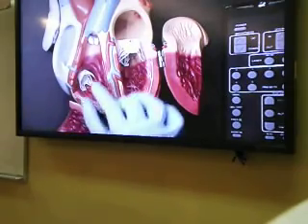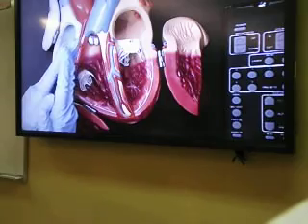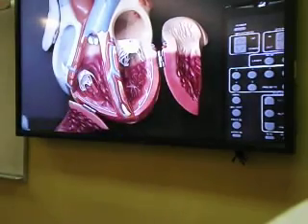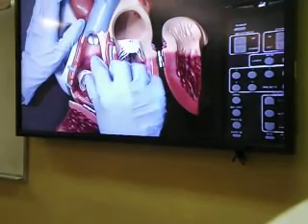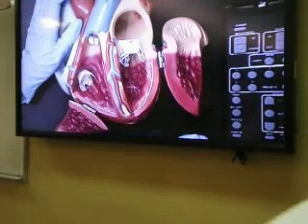And what happens is that as a result of that, the tricuspid valve will be closed. The increased pressure will make the tricuspid valve close between the right atrium and right ventricle. And so that the tricuspid valve stays closed, the papillary muscle will pull on the chordae tendineae to keep it closed.